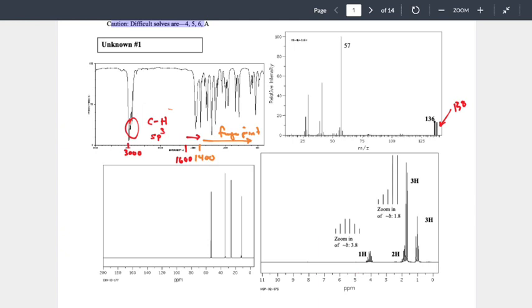The better approach is looking at the numbers at the bottom. Carbon NMR will usually run sets of 10s up to 200. Hydrogen NMR will run as factors of 1. So they're looking at slightly different ranges. Same spectra, believe it or not. You're just looking at different ranges of that spectra.